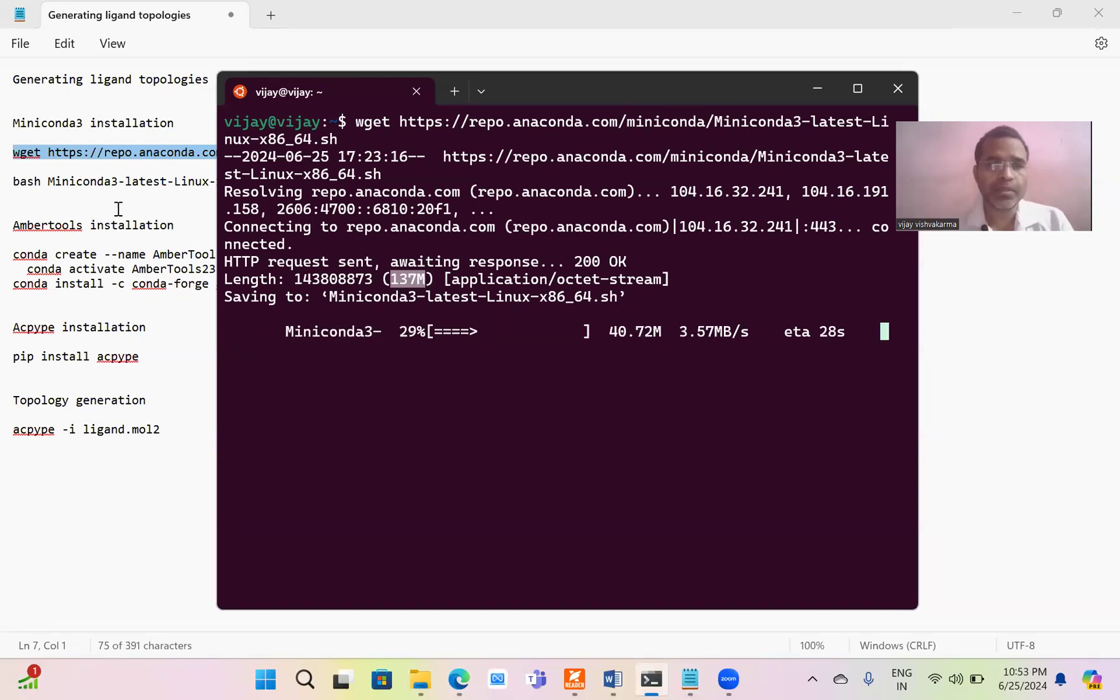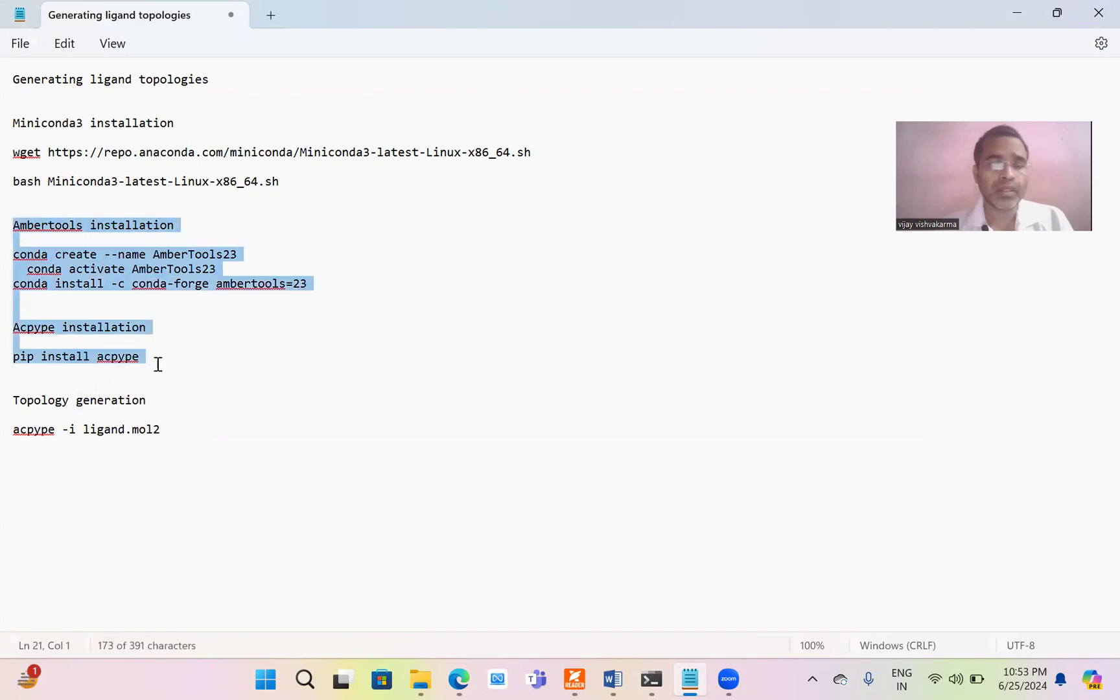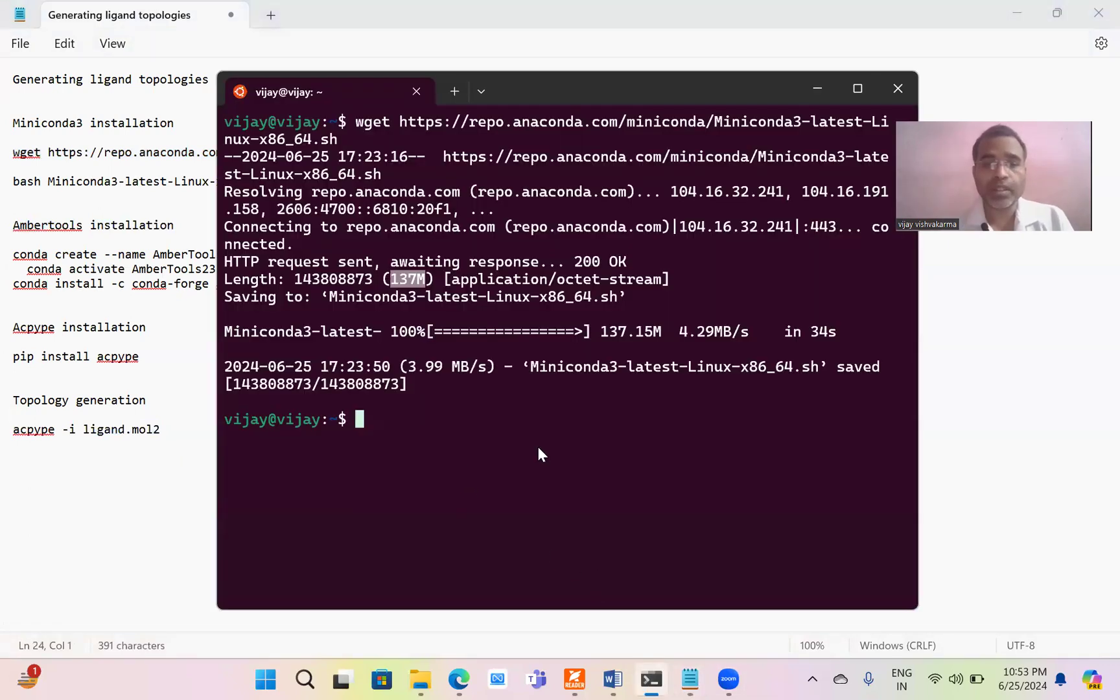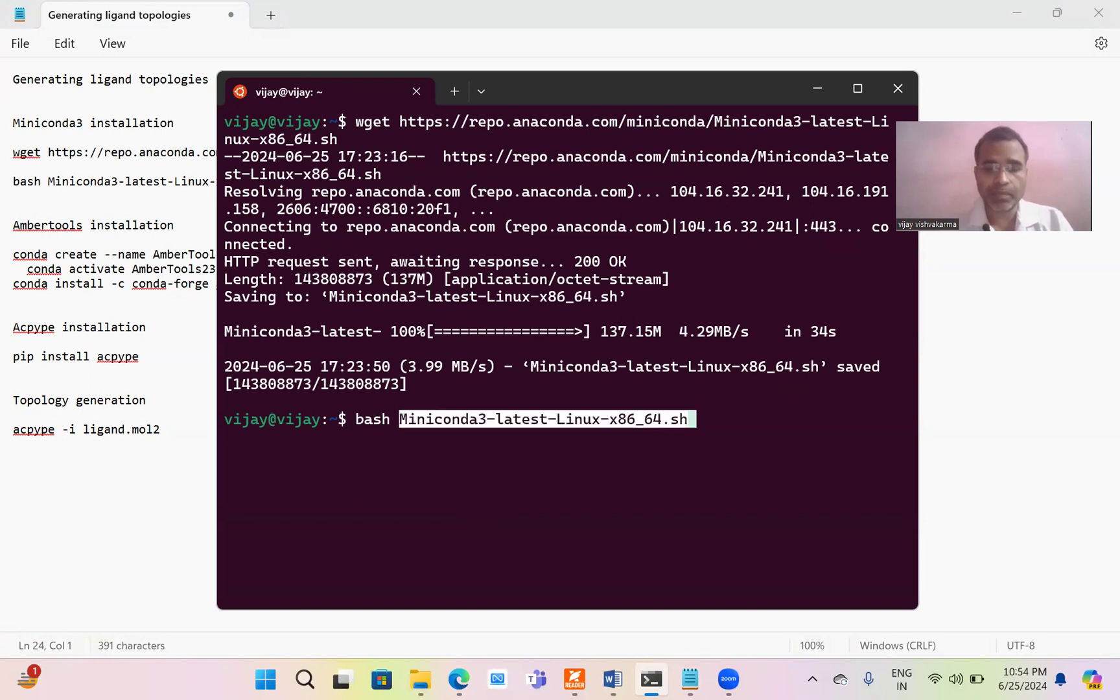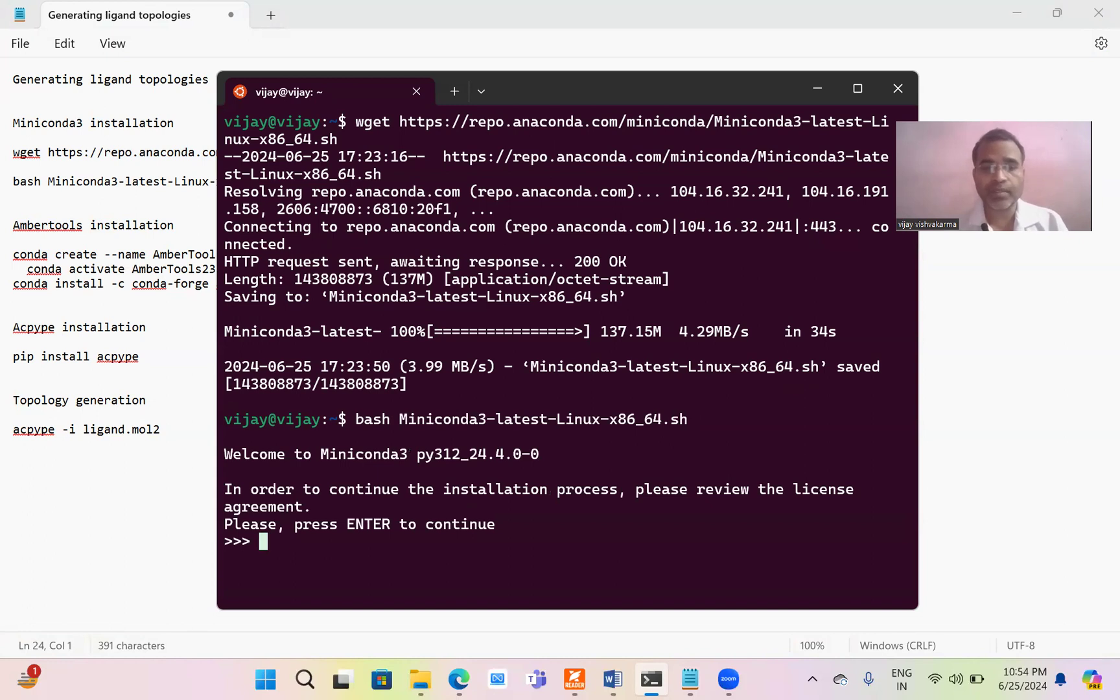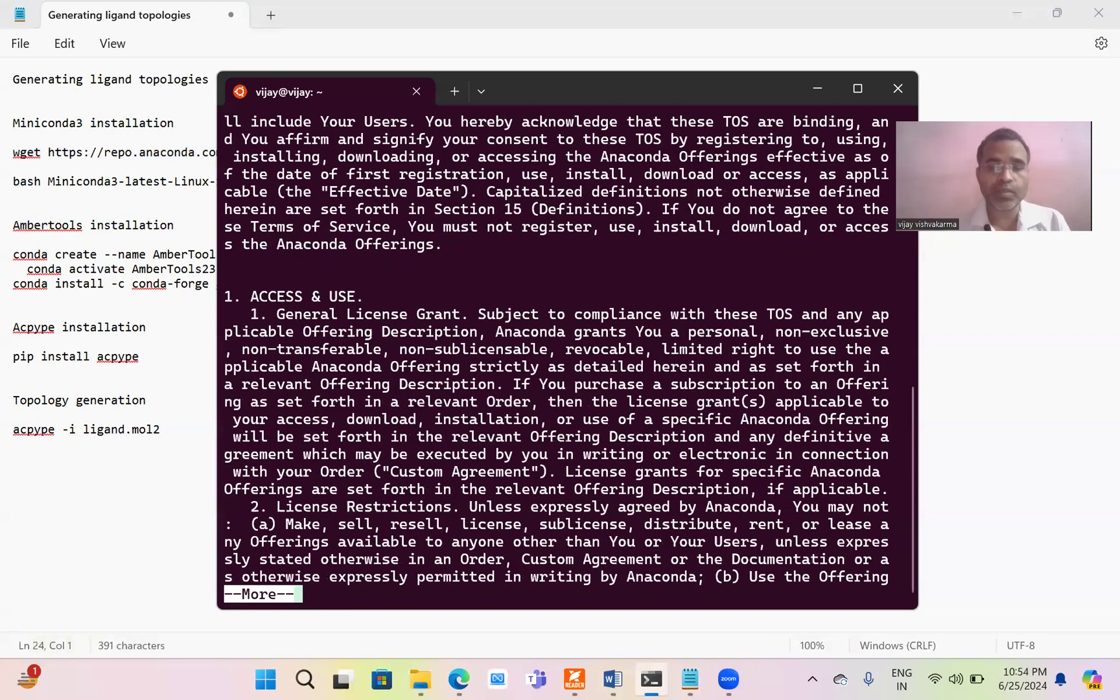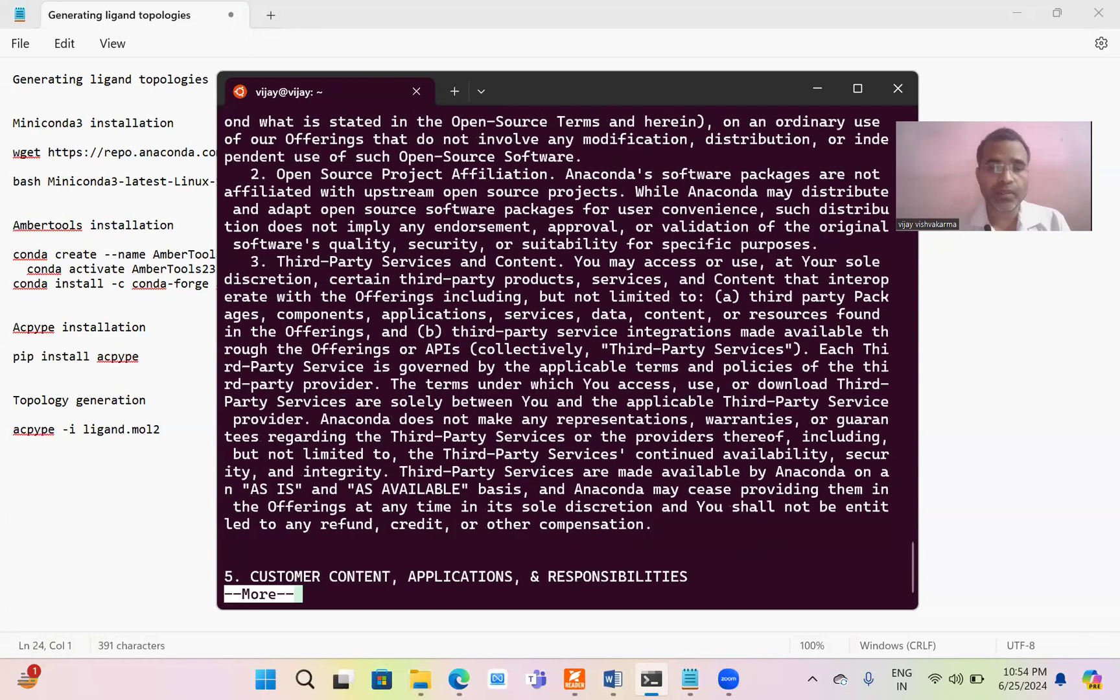After that, we have to install the Miniconda. After the successful installation of Miniconda, we have to install AmberTools and ACPYPE. After installing these two softwares, we will be able to generate the topology. The simple script is using ACPYPE. ACPYPE is basically Antechamber Python Parser script. This is Python-based script. Now we have to copy this. It will be downloaded to the location which we are currently running. Just type here bash. Now press enter. It will ask to install the Miniconda which is based on Python. We have to press enter multiple times.